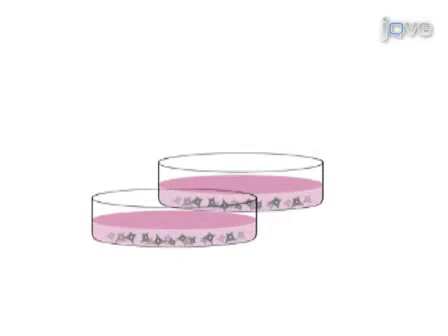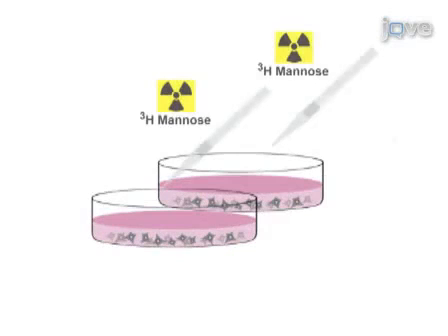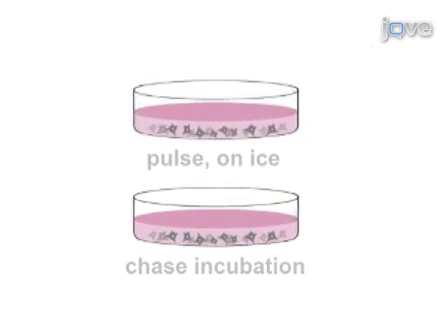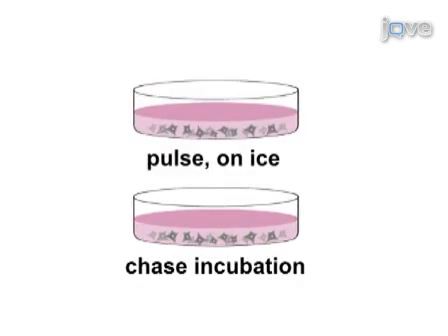Analysis of the N-linked sugar chains on glycoproteins starts with the labeling of the glycans in cells with tritiated mannose. The pulse dish is cooled on ice, while the chase dish is incubated with no label for a desired chase period.